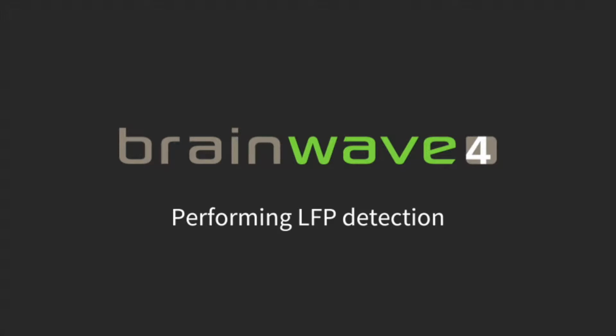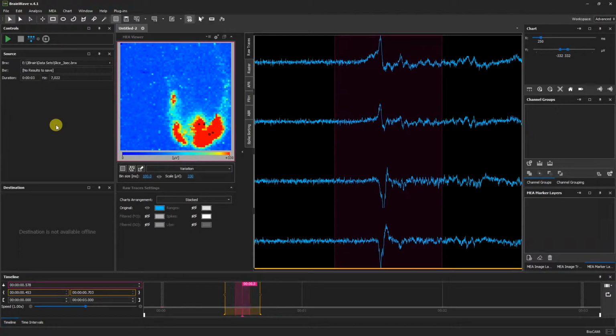Performing LFP detection. We have opened a raw data file and are using the advanced workspace. Note that we have optimized our view settings to get a close-up look of our data. We have configured the X and Y axes on the raw traces chart and adjusted the color map.